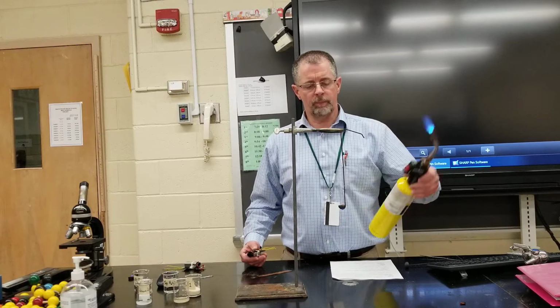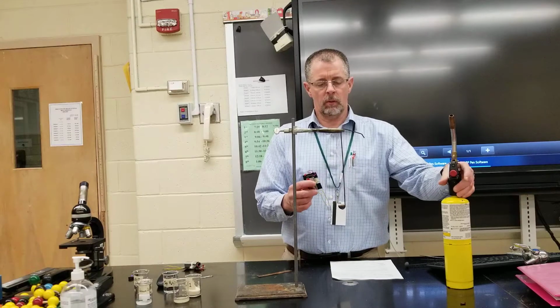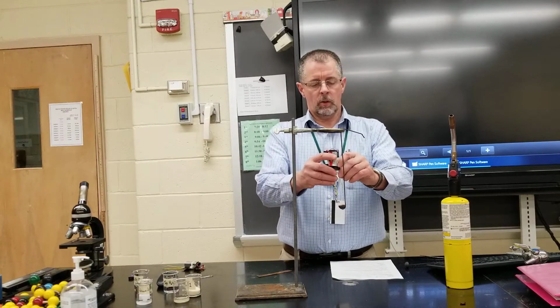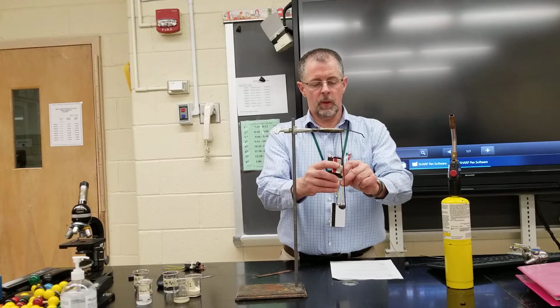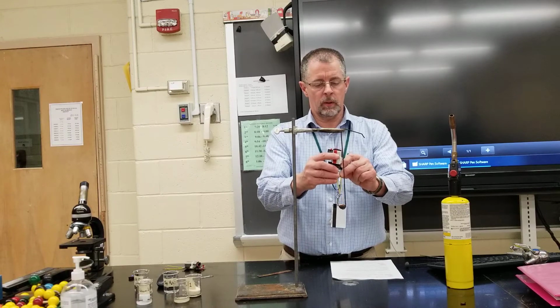Number 1 melted very quickly. So let's see if this one lights up. In the melted phase, it does not have any ions present, so it's not lighting up.